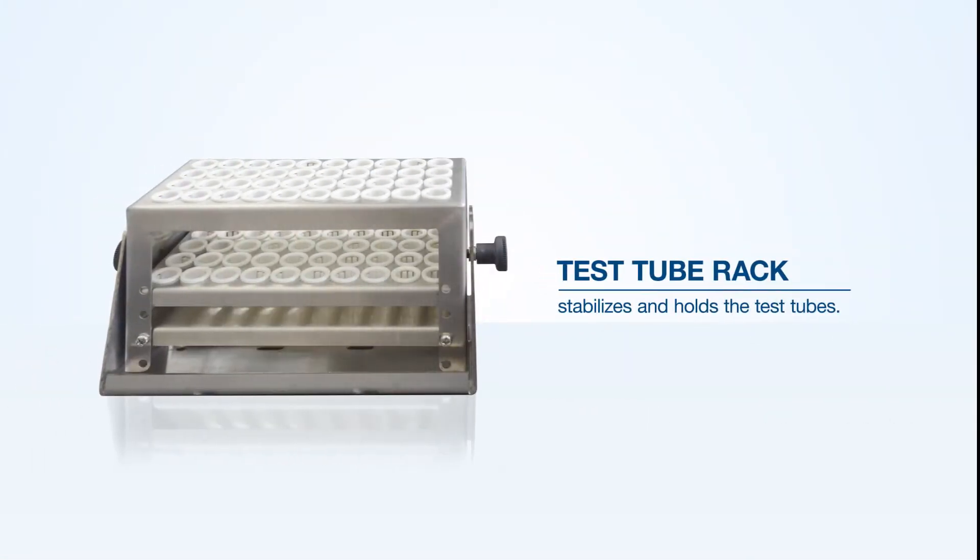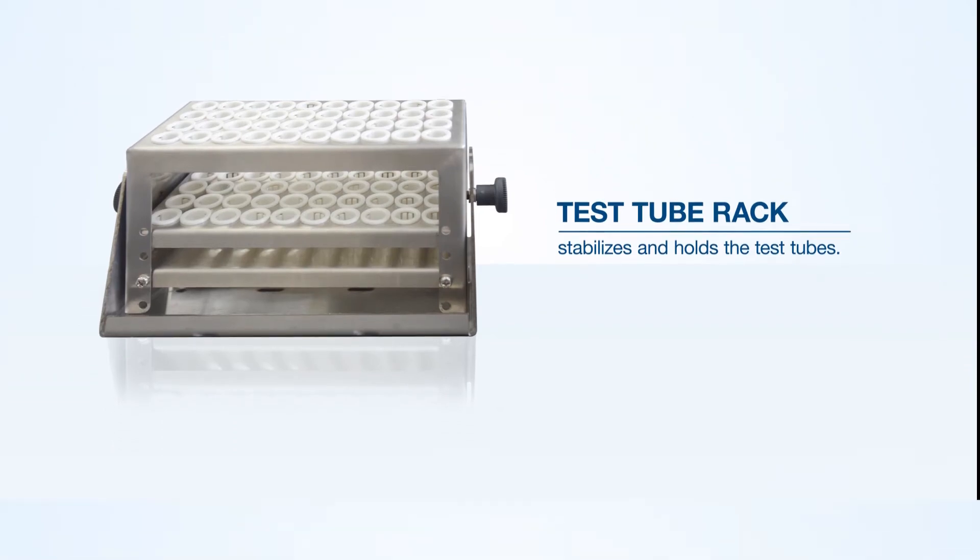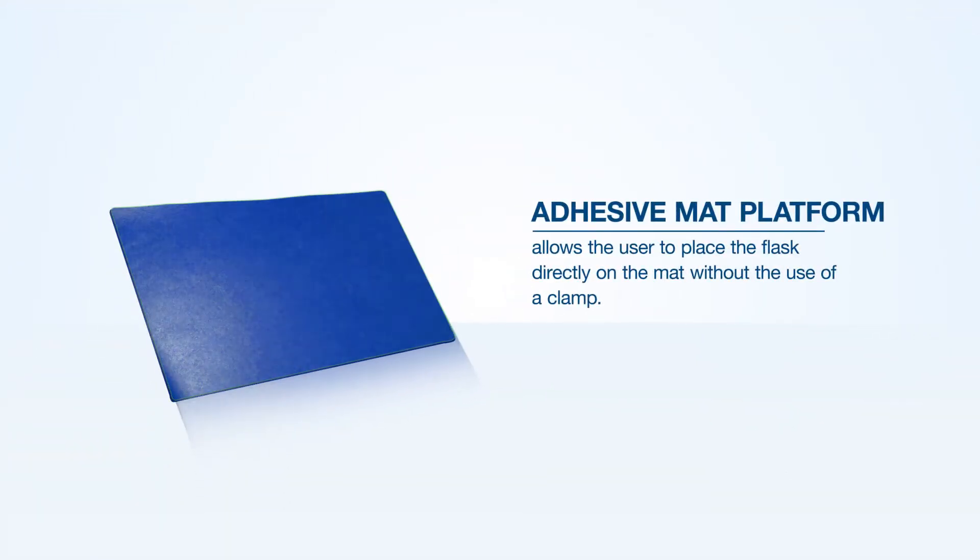Test tube rack that stabilizes and holds the test tubes. Adhesive mat platform allows the user to place the flask directly on the mat without the use of a clamp.